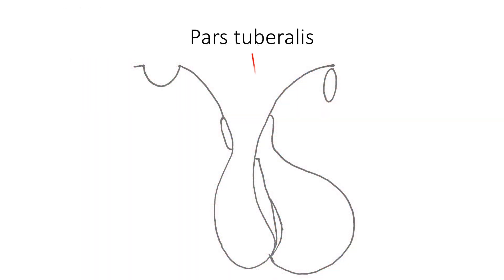The third part of the adenohypophysis is the pars tuberalis. It is a highly vascular region containing the hypothalamo-hypophysial portal system. It also contains cords of gonadotrophs and undifferentiated cells.